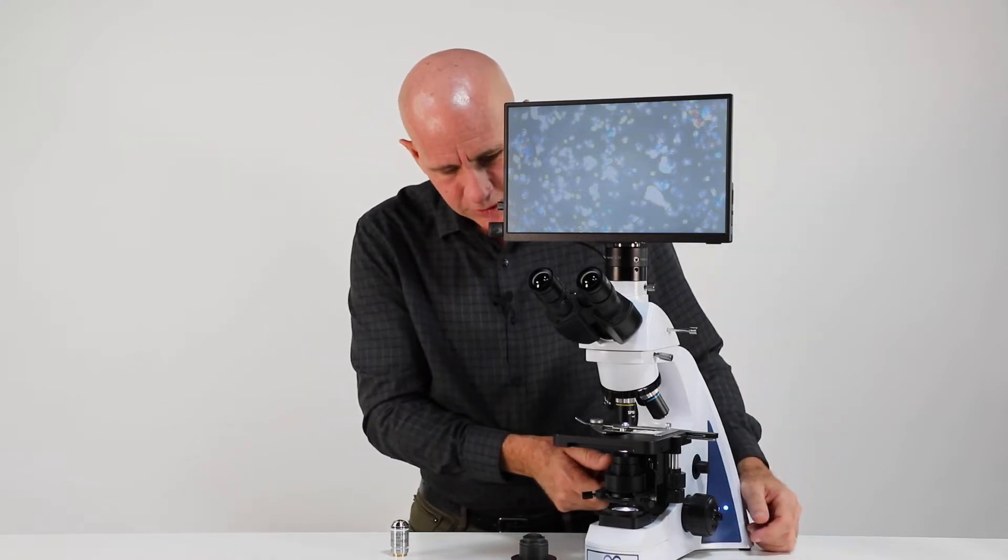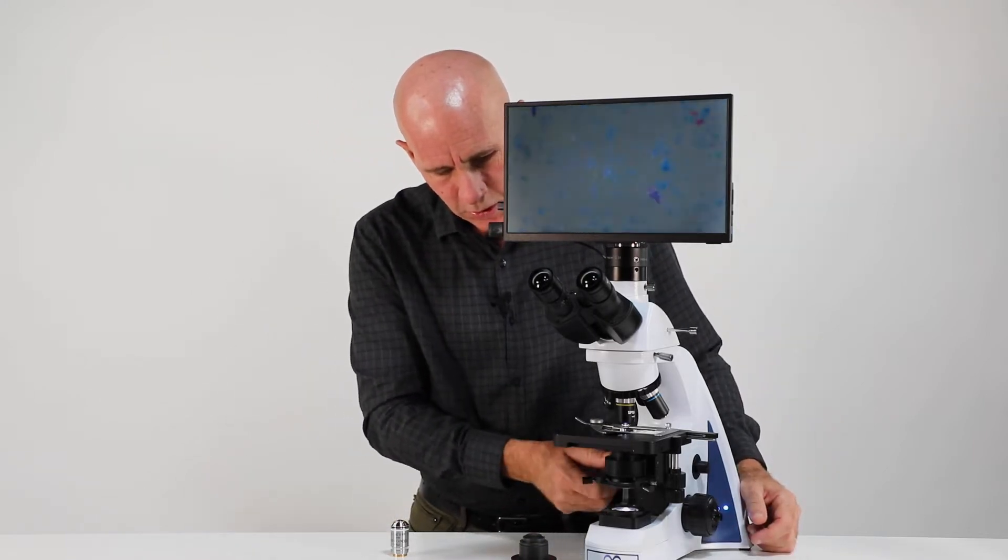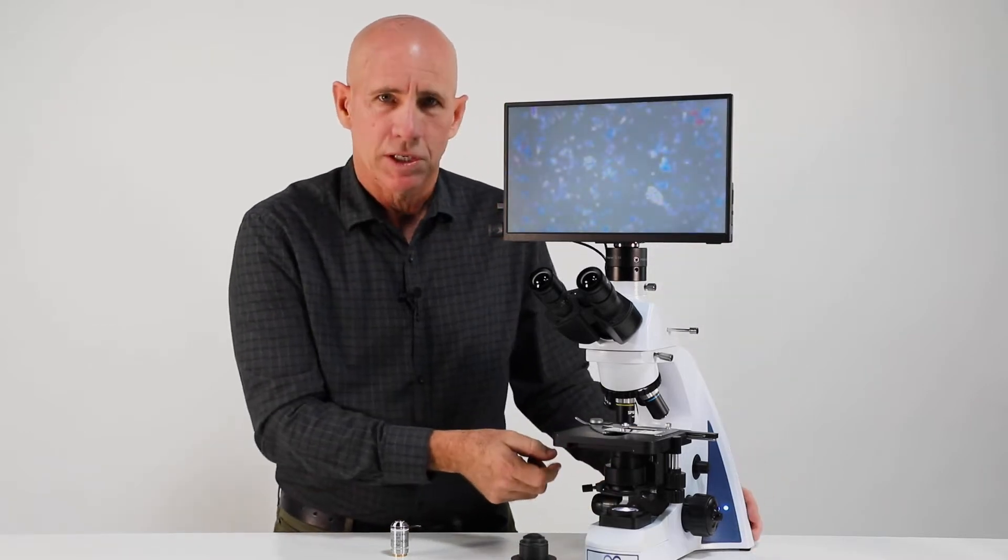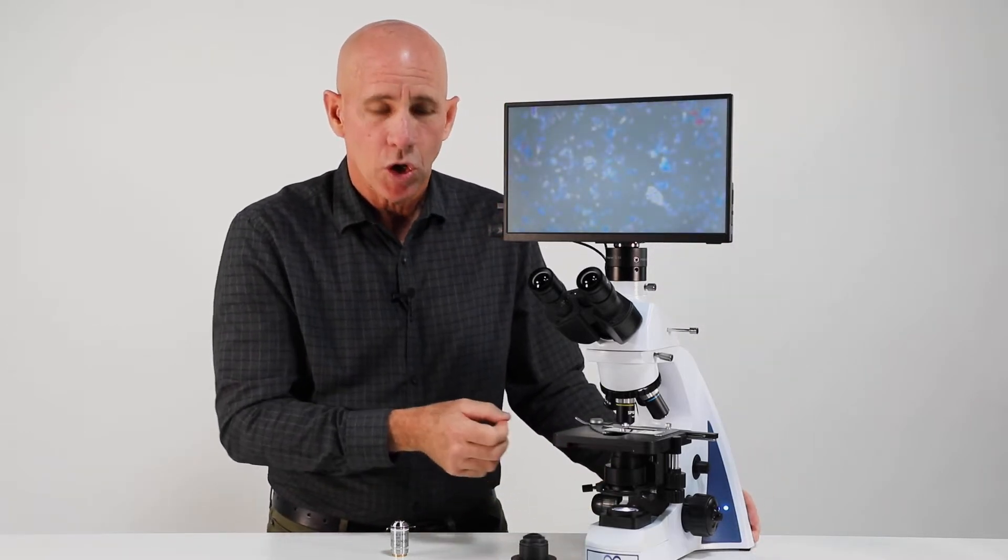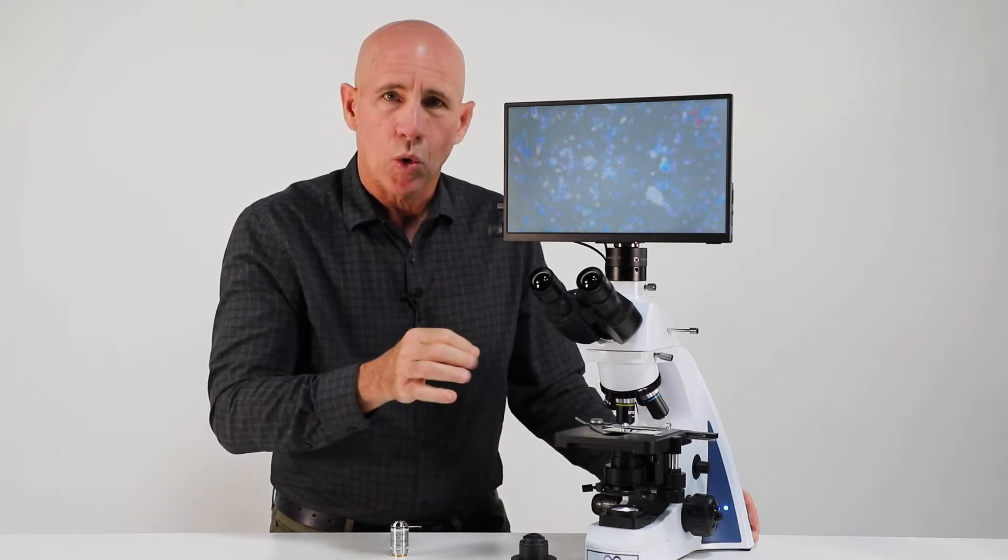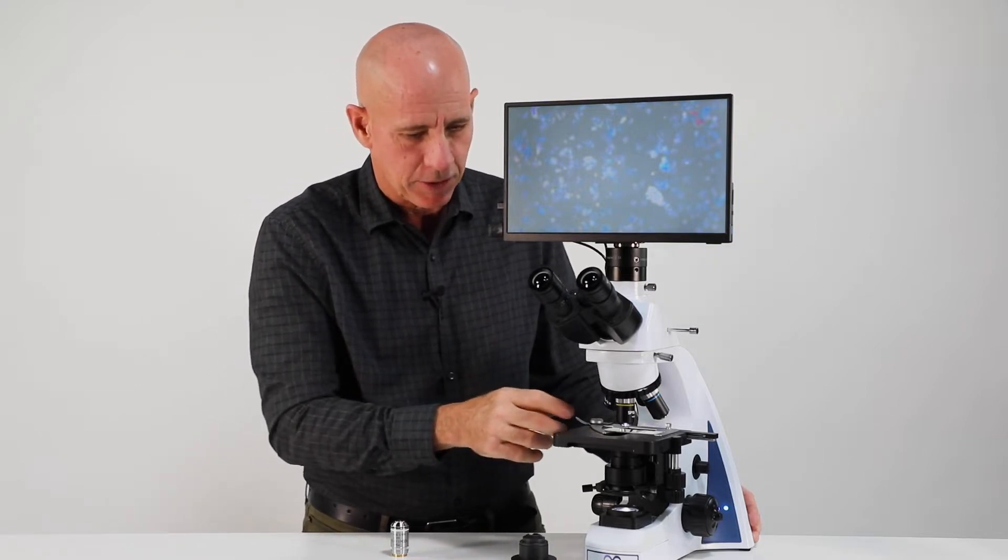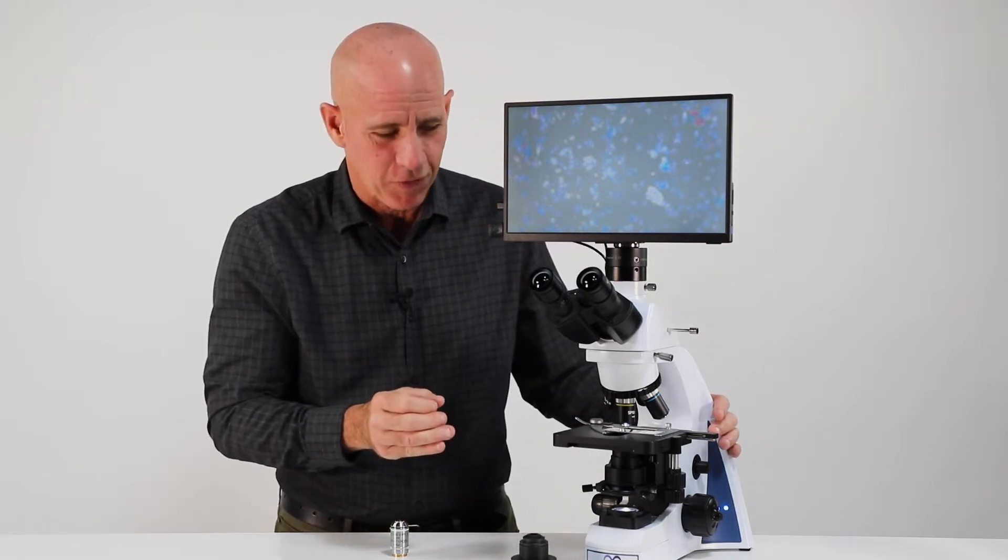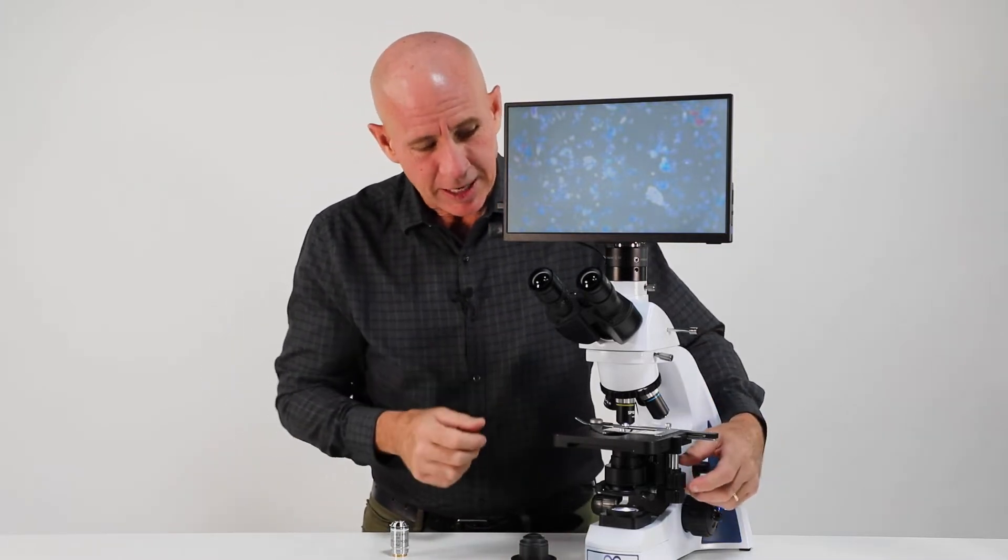So now our dark field condenser is in place, so we can come all the way up. Now this condenser is an oil dark field condenser, which means you're going to put oil on top of the condenser. So it's messy, you have to just be careful and do it in a careful way here.